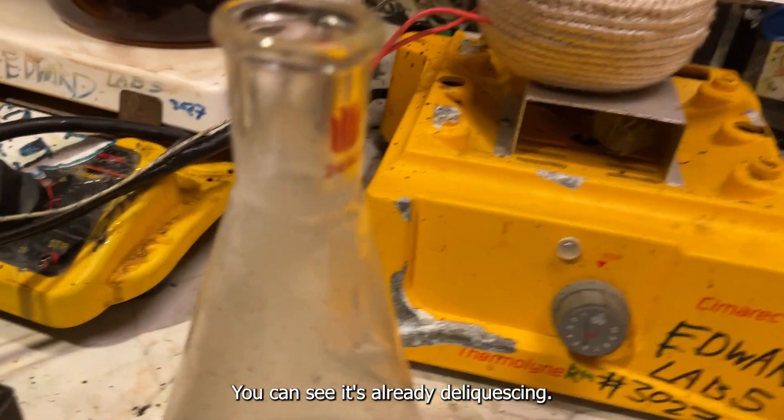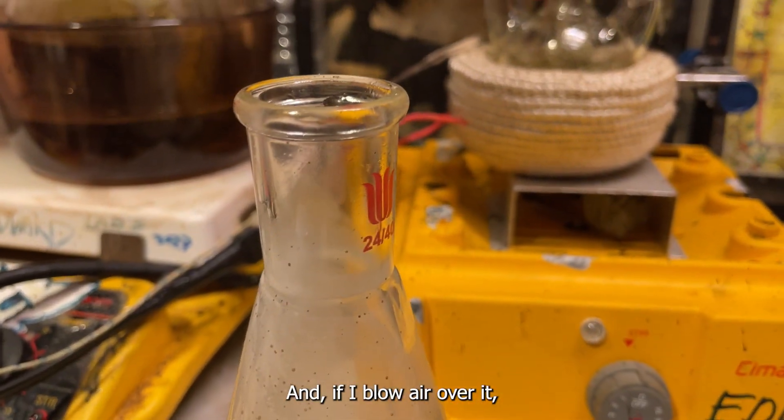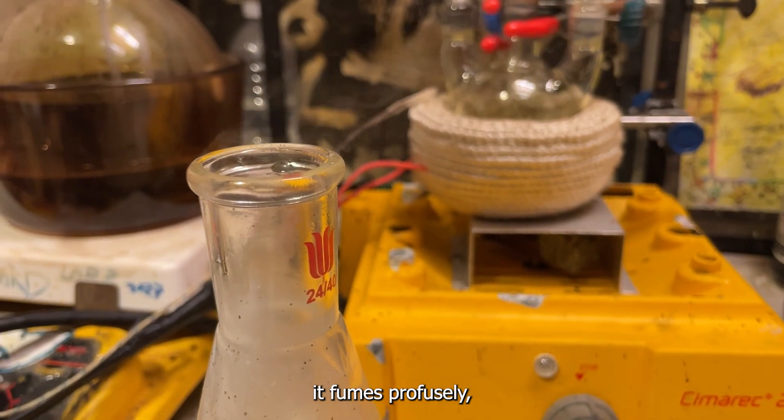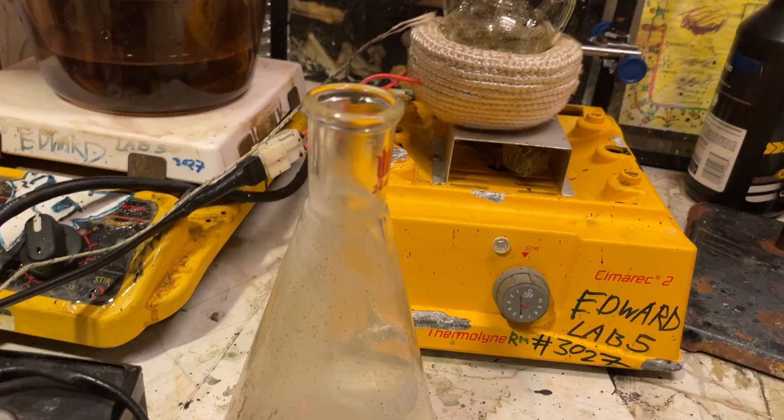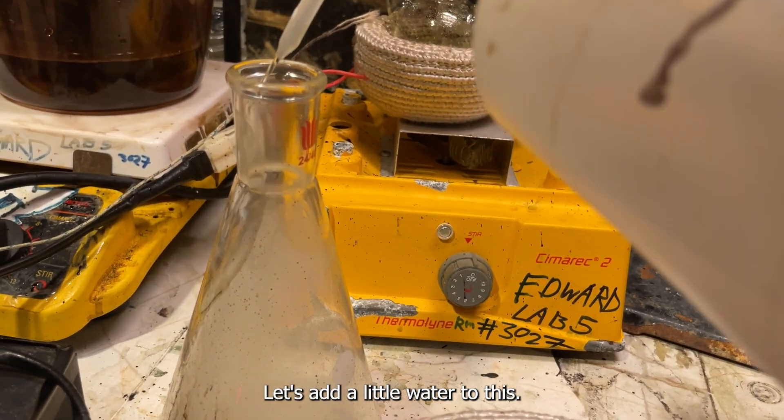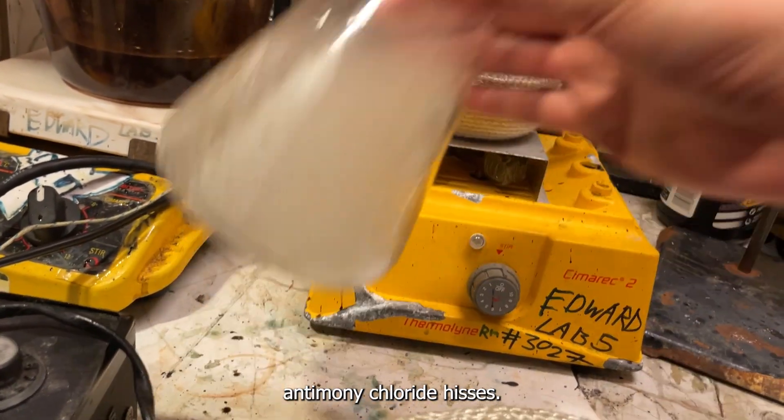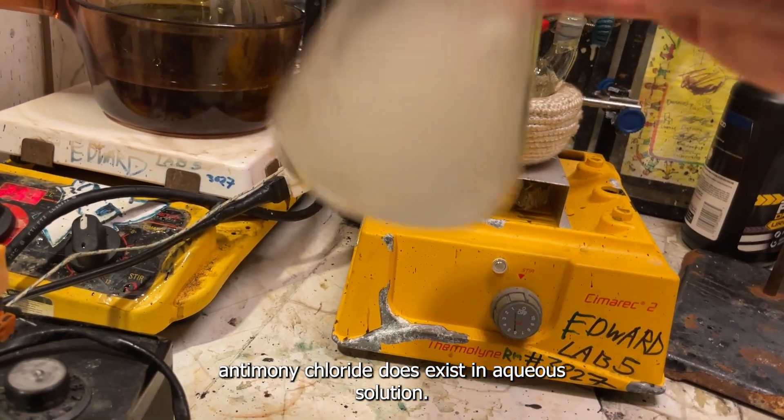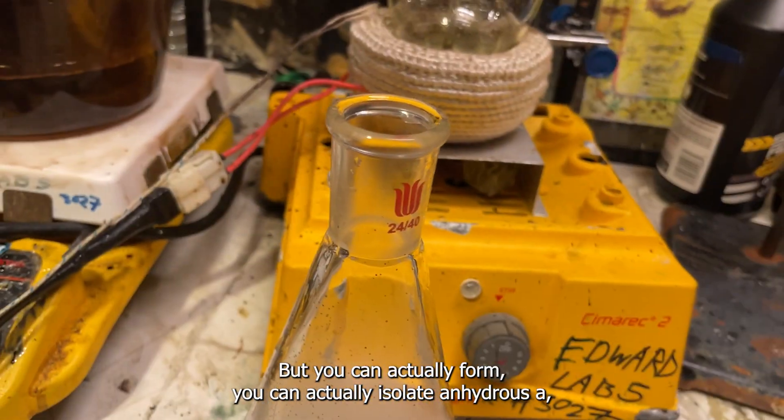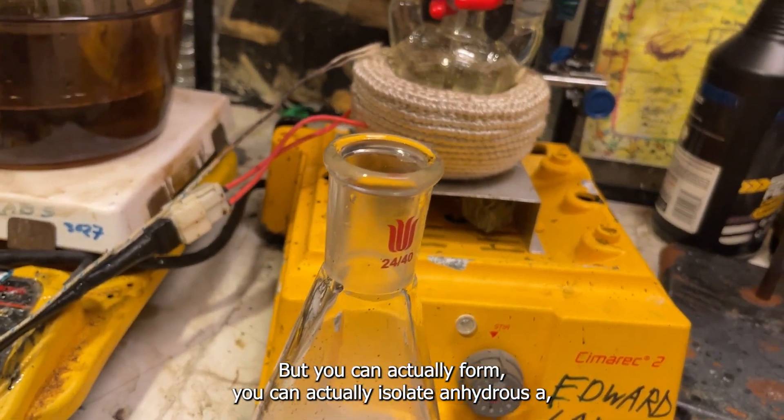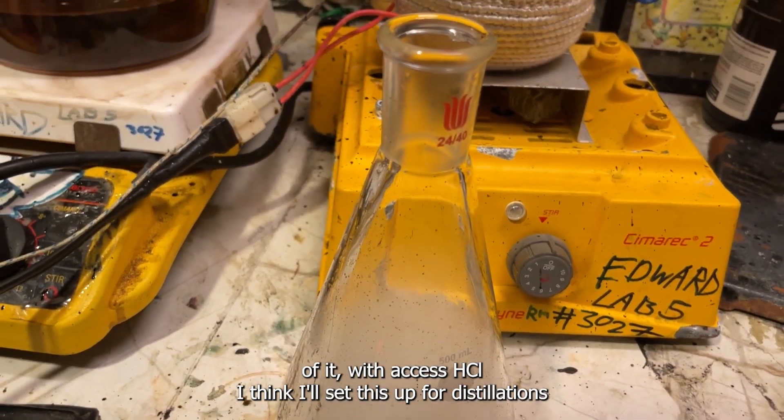A few properties about this stuff. You can see it's already deliquescing. It's liquid because the ground glass is coated. And if I blow air over it, it fumes profusely of antimony oxides and HCl. Let's add a little water to this. Interestingly though, antimony trichloride... it hisses. Antimony trichloride does exist in aqueous solution. You just have to have a lot of HCl in there. But you can actually isolate anhydrous antimony trichloride by distilling a solution of it with excess HCl.